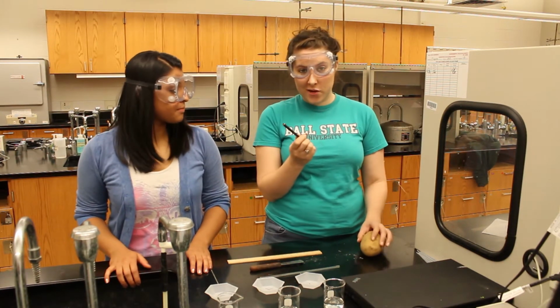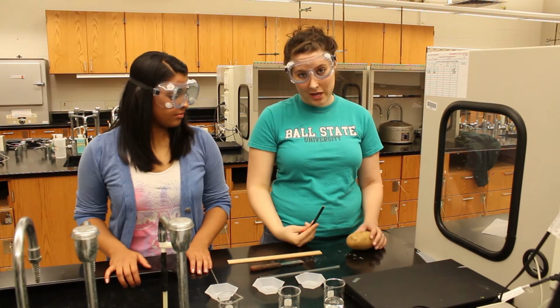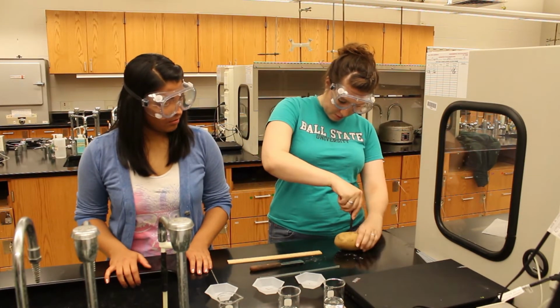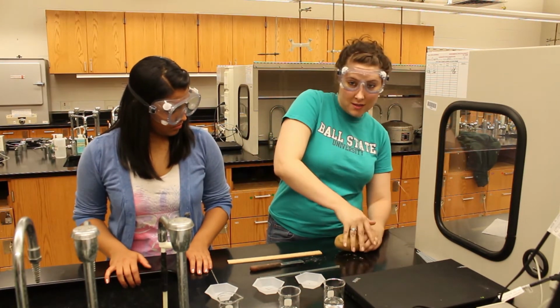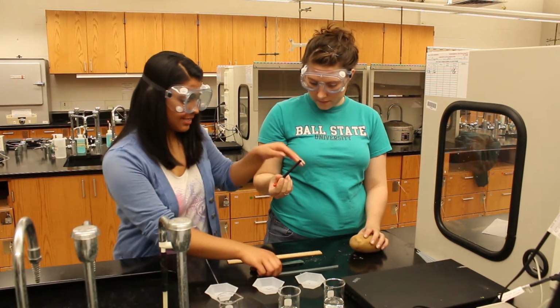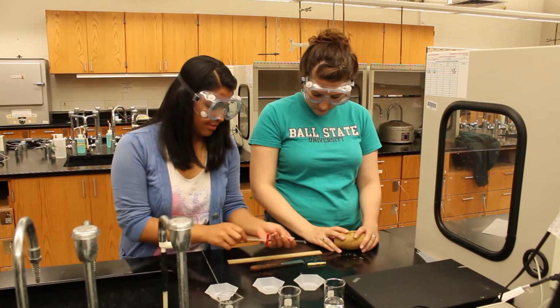We get to use the potato borer. Now be careful because this bad boy can bore a hole right through your hand. Make sure you hold the potato on the table like this and push the borer in like this. Now, if the potato piece gets stuck inside the cylinder, just use a glass stirring rod to push it through, like that.